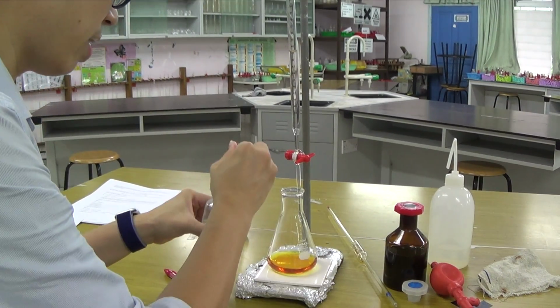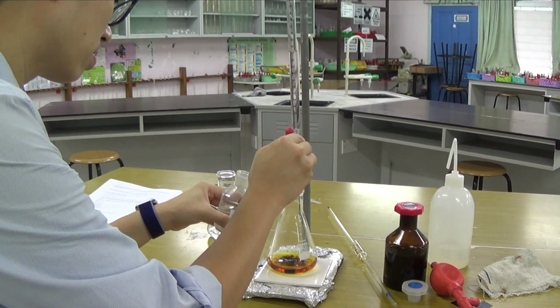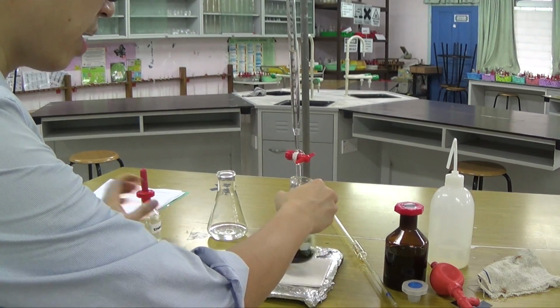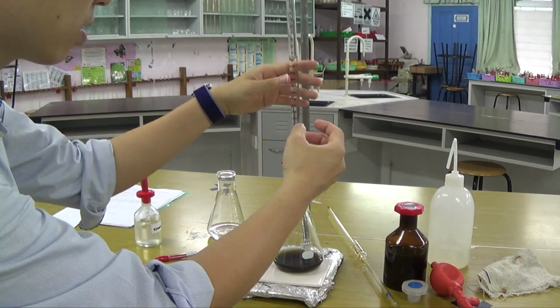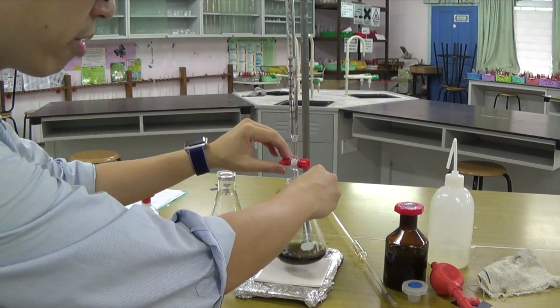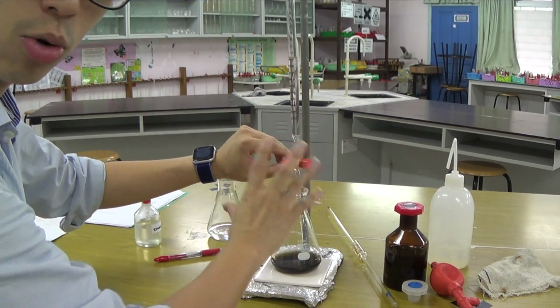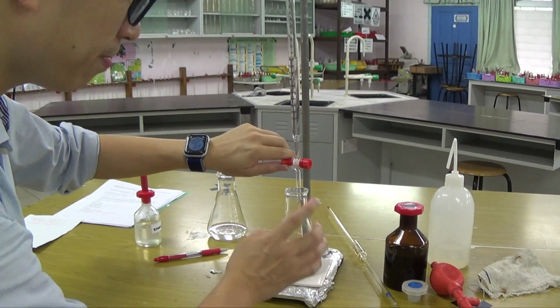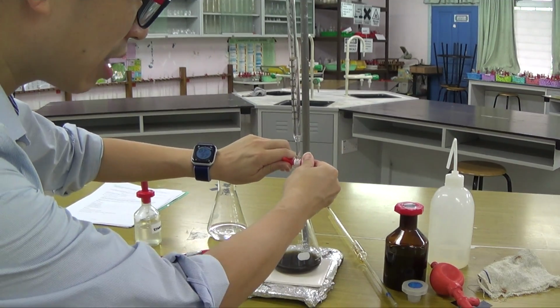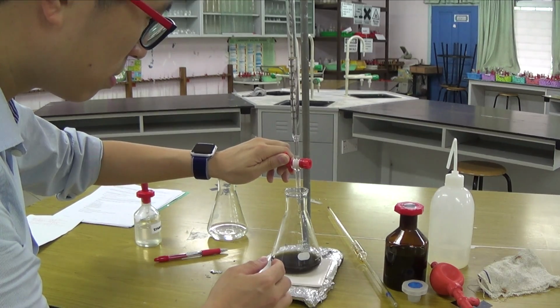So what I'm going to do is add my starch indicator. So 2 or 3 drops, and then it goes blue-black. Now, because I'm right-handed, I am going to swirl with my right, and then I open the tap with my left. I'm very close to the end point. I do not want to open it like that. No sudden movement. Get it drop by drop first. That's the most important thing. Get it drop by drop first.